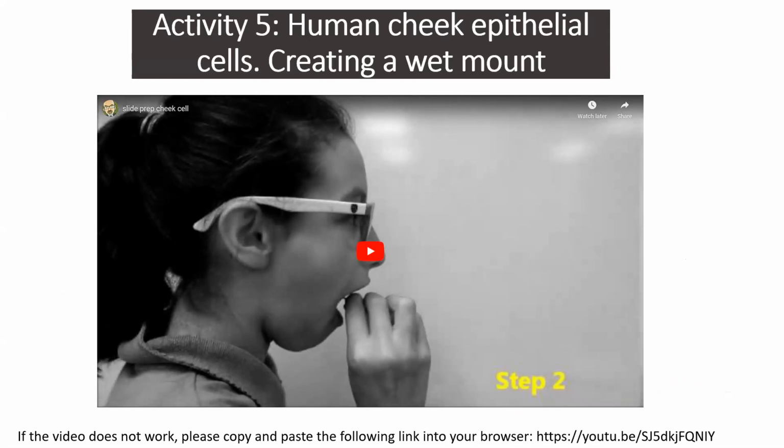I'm not too sure if you're going to hear the audio if I play it here, but I'll post this YouTube video up, and this is basically what we would have done if we were in class. You would use a toothpick to swab inside your mouth, and you would be collecting human cheek epithelial cells. You would put that on a microscope slide and then stain it with a specific dye so that we can visualize our cells. This is called creating a wet mount, and you will put a cover slip on top of it and clean up any mess if needed. The stain you would be adding is methylene blue.